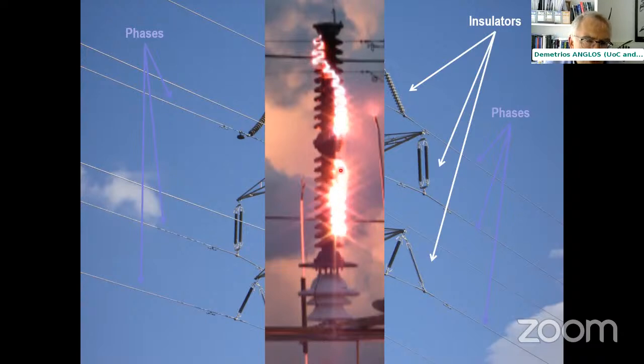But this flashover actually changes the surface of the insulator and changes its hydrophobic capacity. It's important for these insulators to be highly hydrophobic so that water does not really stay on them. And this is something that needs to be checked periodically.